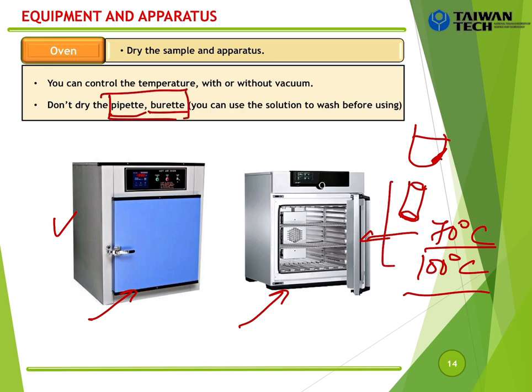So if you wash it and we want to use it immediately, how to use it? We can use the solution you want to measure and wash the pipette and the burette before using.